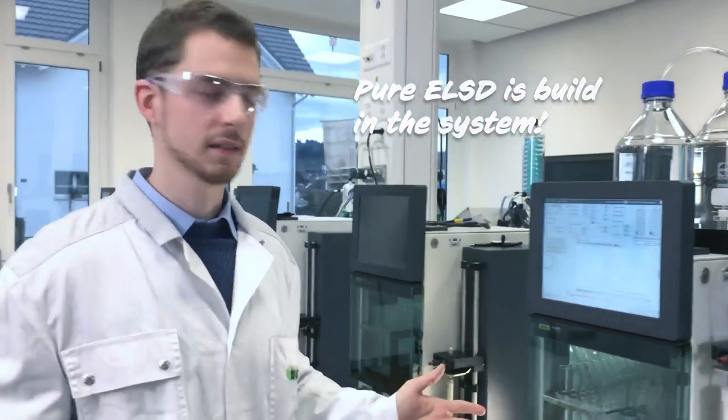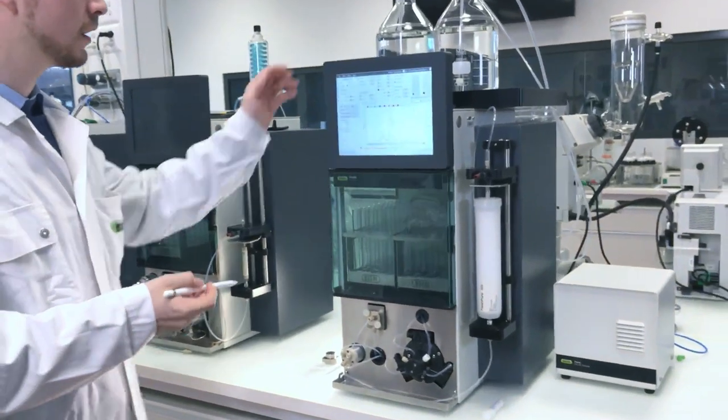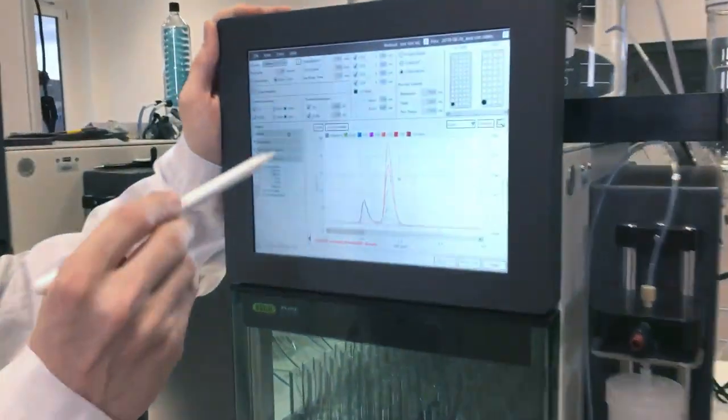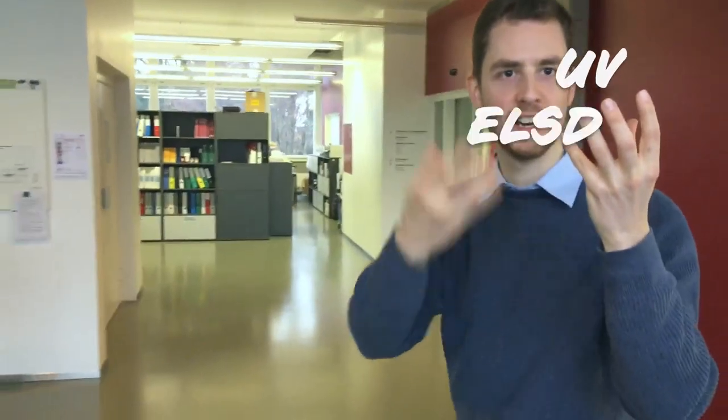And that's not all. The pure ELSD is built-in, so there is no extra space needed. And of course, the UV detection is always running simultaneously with the ELSD. The perfect match, UV and ELSD.